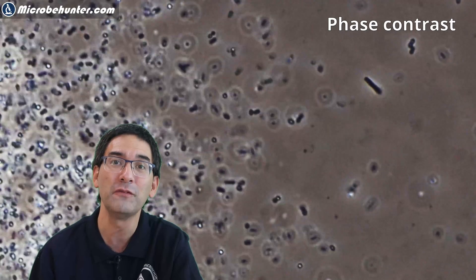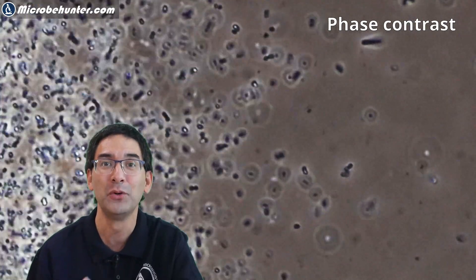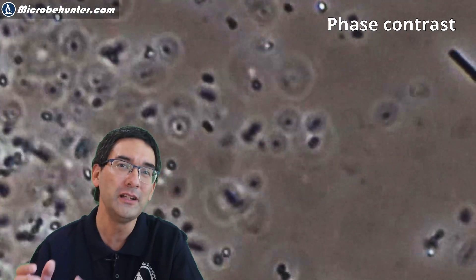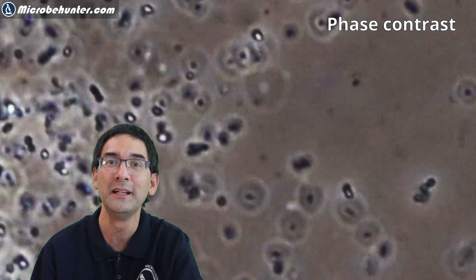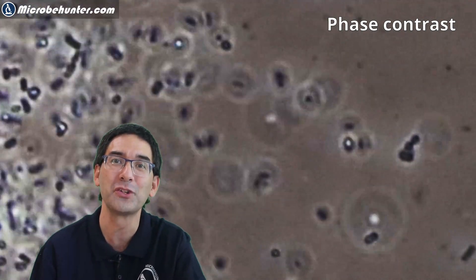I've been using phase contrast now, but I'm also going to show you some other techniques. Most of you probably don't have a phase contrast microscope, but it's also possible to see them in bright field, although the contrast is a little bit lower. Here I'm really zooming in a lot with my video editing software and you can already see the different shapes of the bacteria. You can see it's kind of blurry already because I'm way beyond the resolution limit of the video system and also of the microscope.